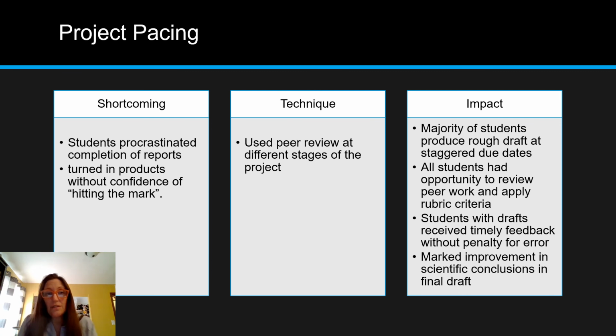I had a higher rate of students identifying the correct organism because they took a look at their experimental results, and instead of just going based on their feelings, they followed the data, and students felt better about it.